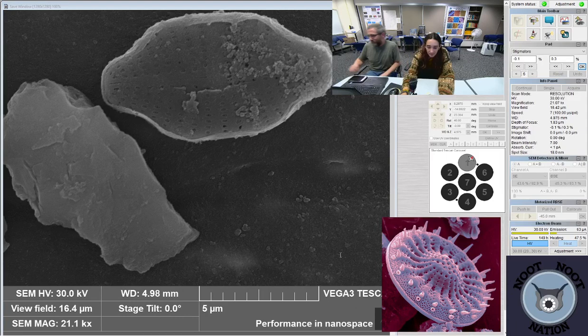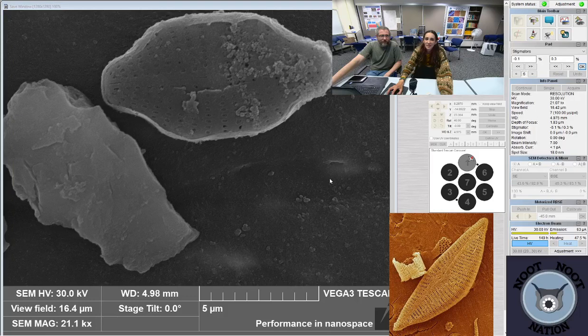I know we've seen this one, but I can't remember. It's Placoneis zeichlerite? Platessa... I need to review my Platessas.